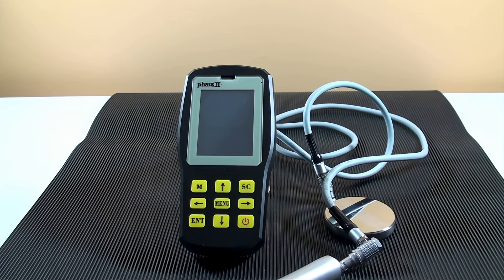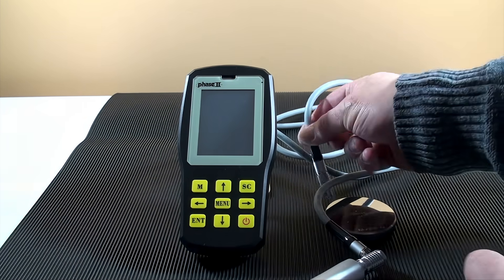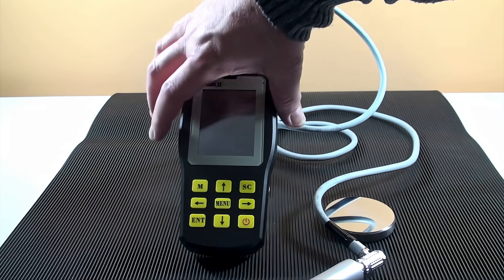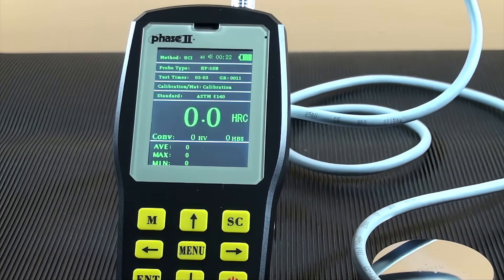Let's move to the different functions and operations of the tester. Attach the 90 degree end of the cable to the probe, then attach the other end to the tester module. Power the unit on from the left side of the body. The interface will show you at top left the method of test being used, either UCI or Leeb.